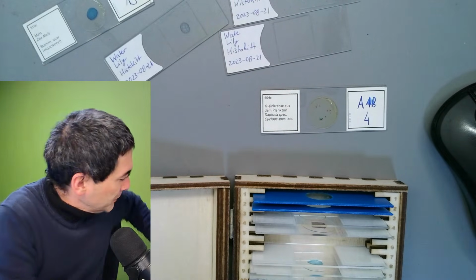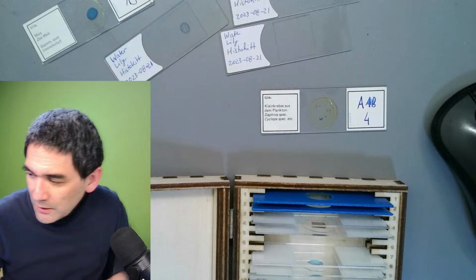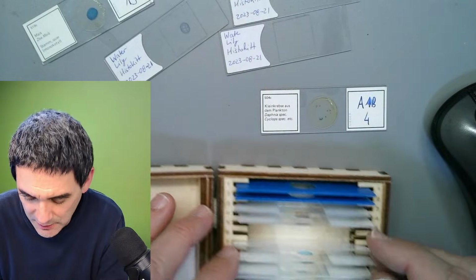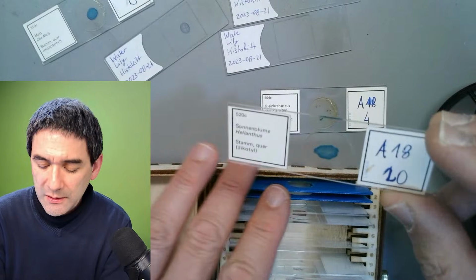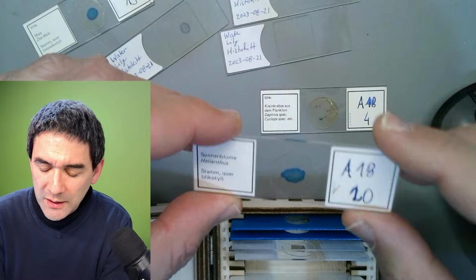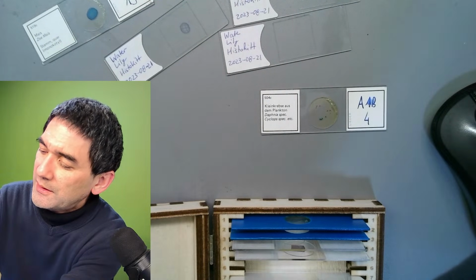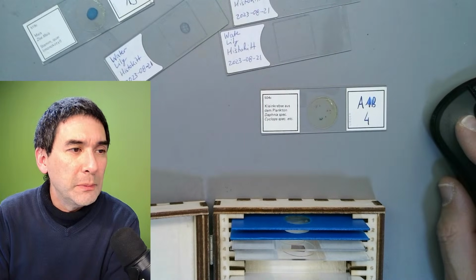I do have a couple of antique slides as well that I want to show you. So let's go on. These are diatoms. Let me quickly have a look. This one is another one. This one here I've also made. Look, the cross section of the stem. It's huge, and this one is a nice one because it shows how the structure of the cells is different to a so-called dicot plant.